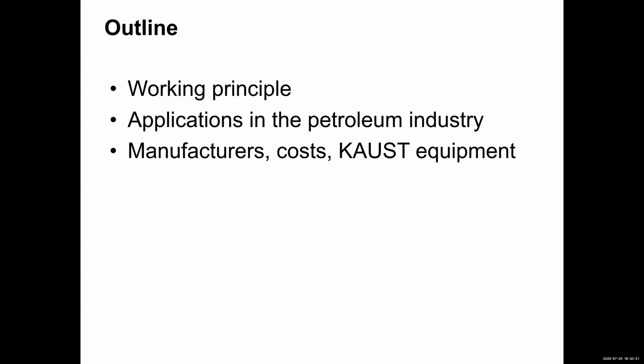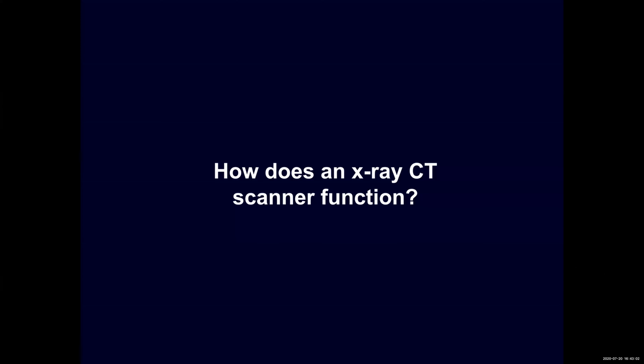This is the outline of my presentation today. I'll first go over the working principle of the X-ray CT, followed by some applications in the petroleum industry, and close with some miscellaneous information on the device.